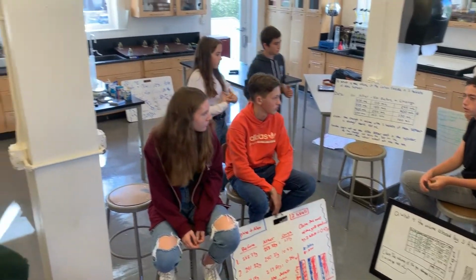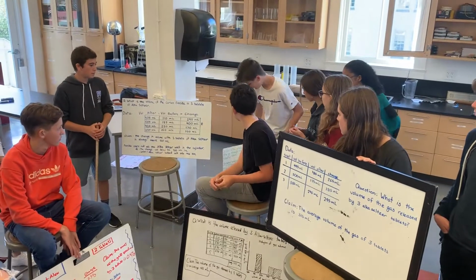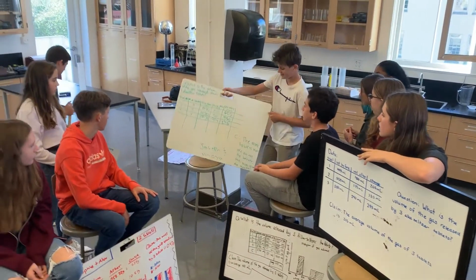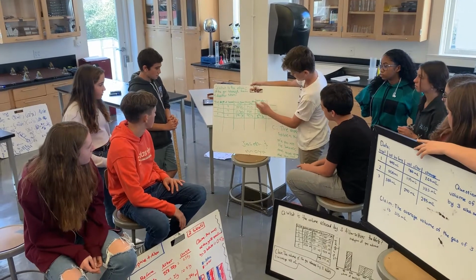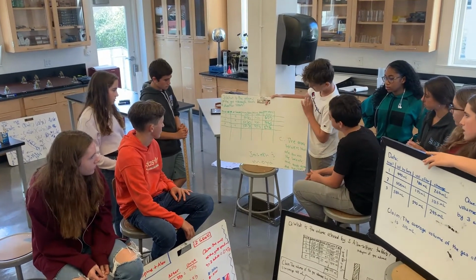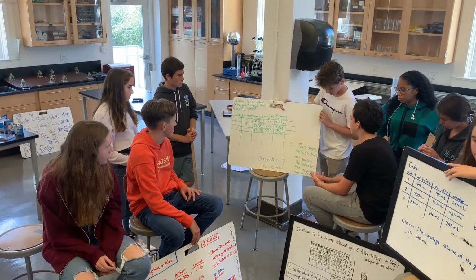Okay. So let's do, oh, I'm sorry. You used 4? Yeah, we have 4. So we had 3 trials, and in our first 2, the gas volume was pretty consistent. We had 525 and 530, but our third one was an outlier, and we had 275. So 2 out of 3 were good.